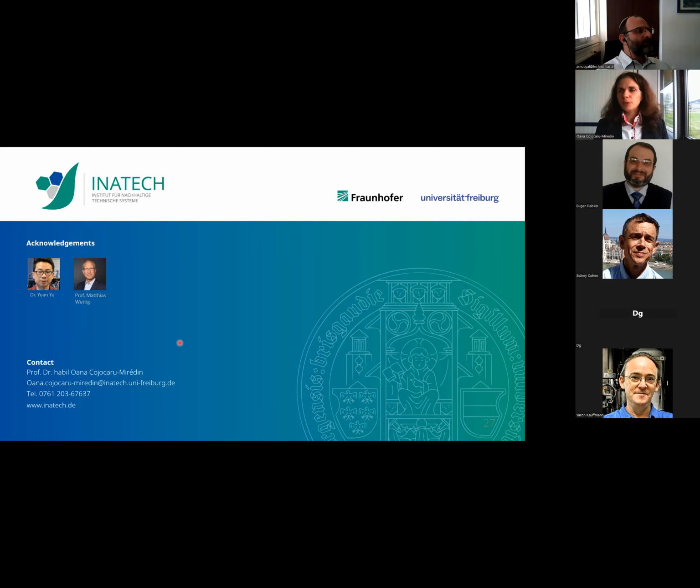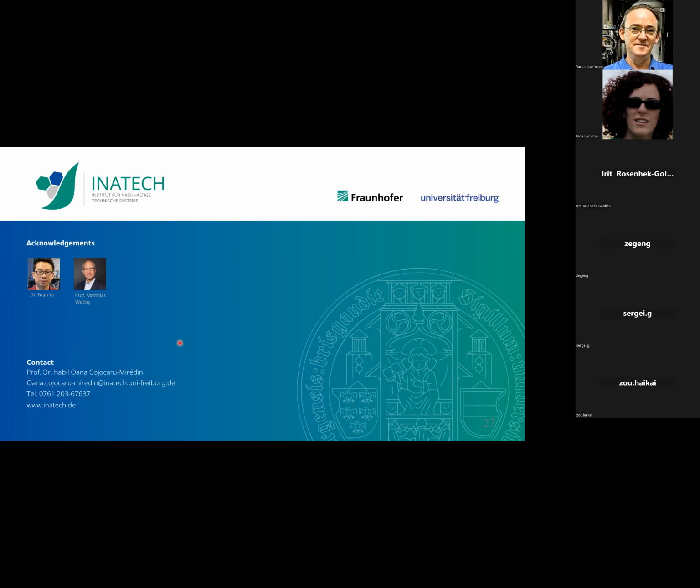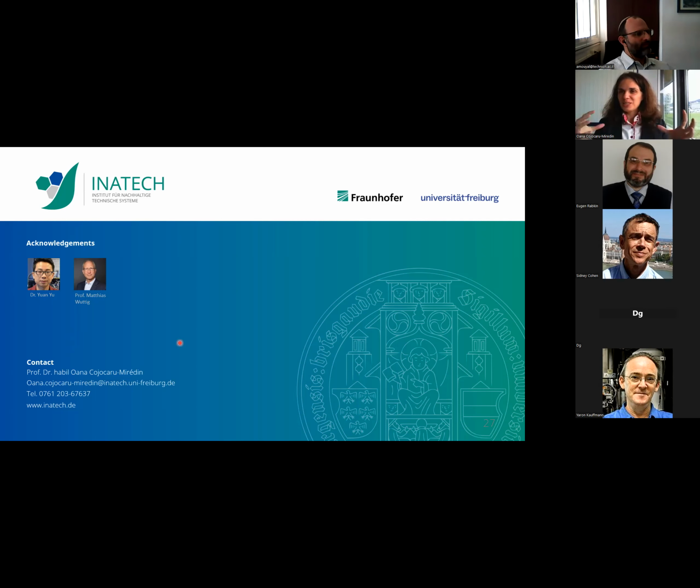Of course, correlative microscopy also needs complementary expertise, complementary techniques, and also opens the possibility to create collaborations, because you might be an expert of the atom probe, but not necessarily an expert of the whole setup like I showed here. Here we had three expertises to reach one study, but it's at the end very rewarding, and I think this also offers the possibility to put people together to work on a joint project, which opens new science, and it's also very rewarding for the group. Thank you.